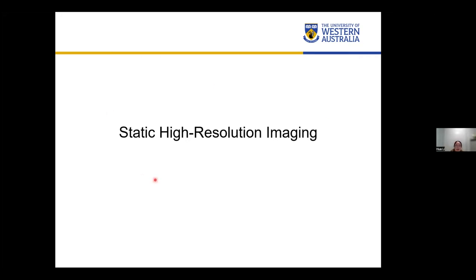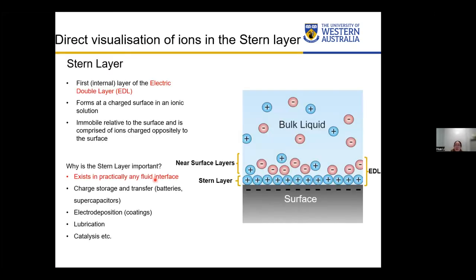First, let's look at some normal slow but high-resolution images. We used this AFM to directly visualize ions in the stern layer. When ions adsorb from the bulk to the interface, they usually form a double layer. The surface front layer is called the stern layer; on top of that are a few near-surface diffusion layers. Further from the surface, the structure decays to the bulk. The stern layer is usually immobile relative to the surface and is comprised of ions charged oppositely to the surface.